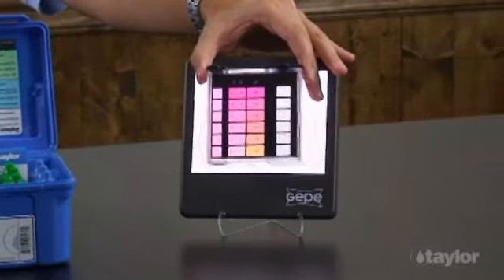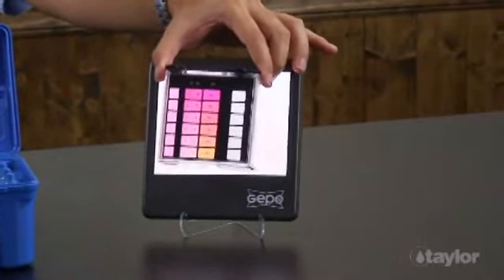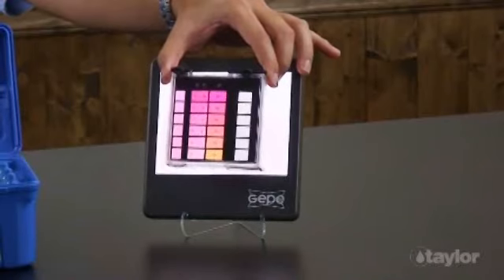Color matching should be conducted outdoors in natural northern light or indoors with the aid of a daylight simulator.